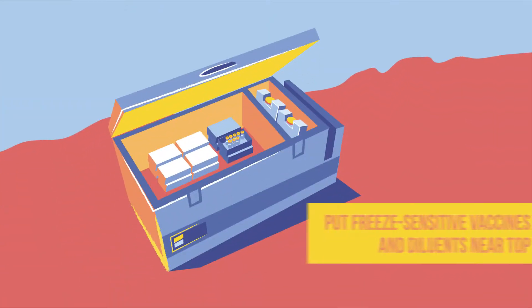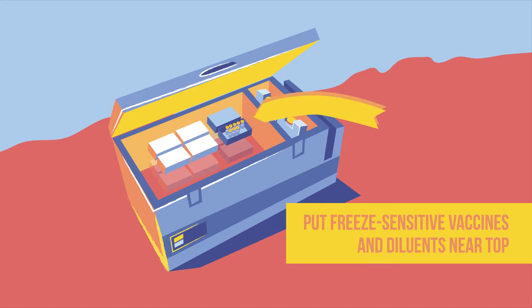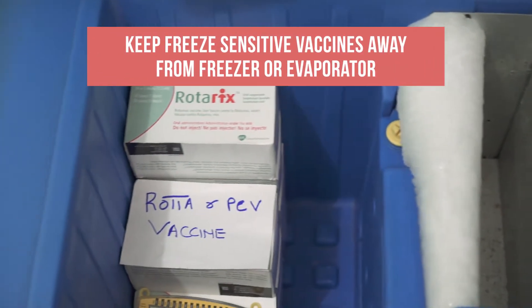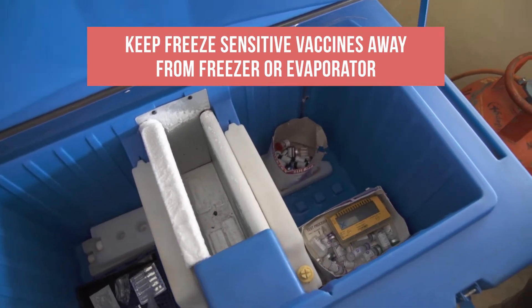Freeze-sensitive vaccines and diluants are placed near the top because colder, heavier air settles at the bottom. Freeze-sensitive vaccines are also kept away from the freezing compartment or evaporator plate where temperatures are colder.